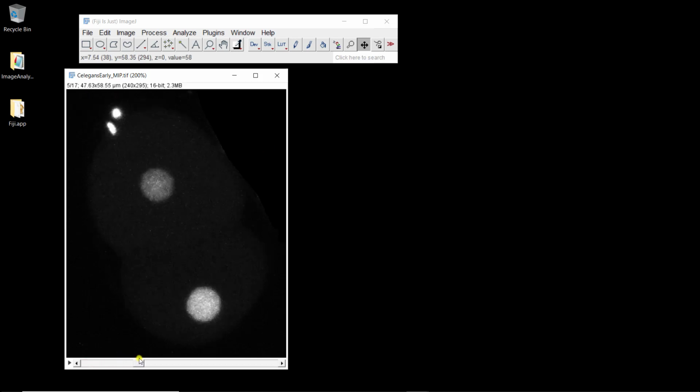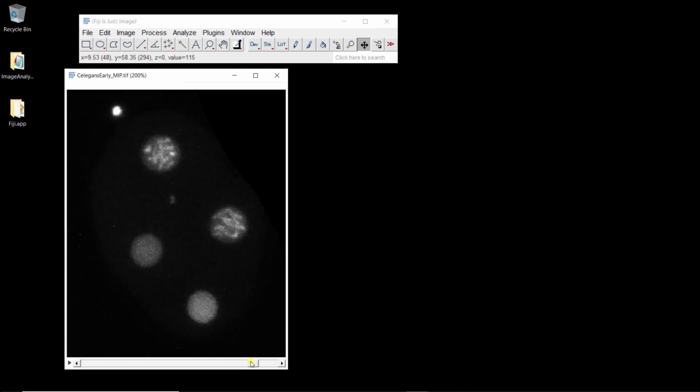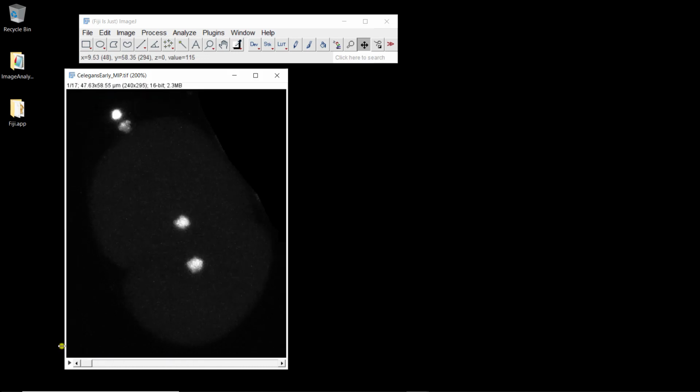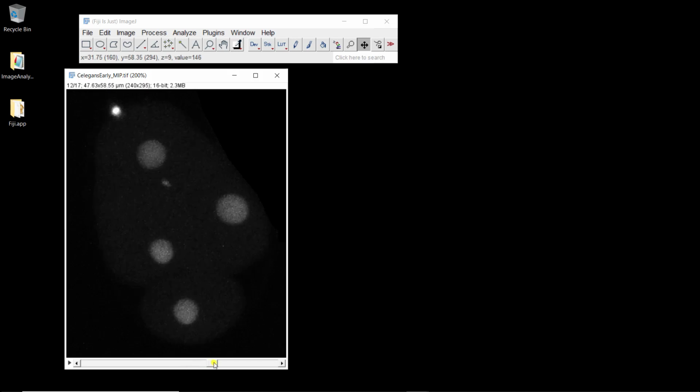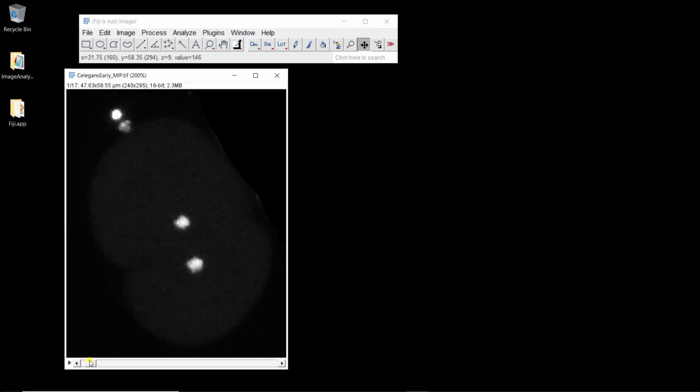So as you can see here, let's start with these two cells that divide, and then each of them divide into two daughter cells. And then it's going to keep going here. We see it starting the next division, two of them. As you can see, we also have some biological objects here at the pole of the cell. I'm not sure exactly what it is. We see it might be mid-body, or I don't know exactly. Clearly not cells. So they're going to disturb the tracking. So we'll see how we can deal with that.